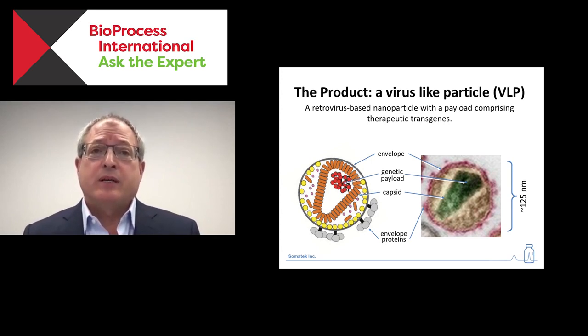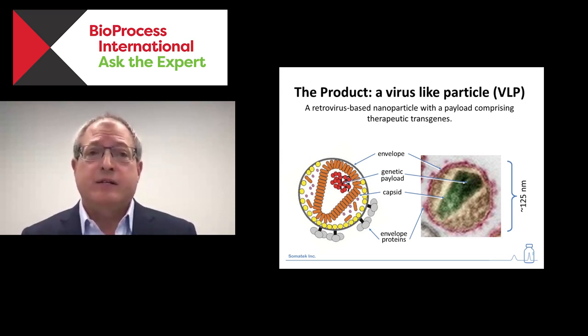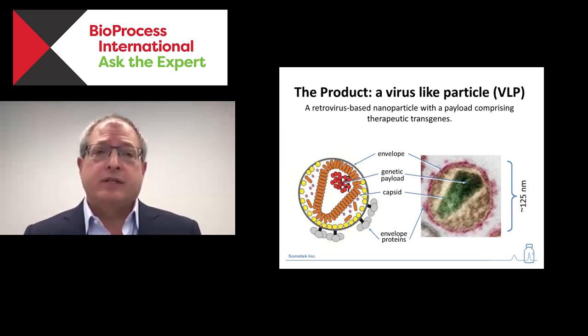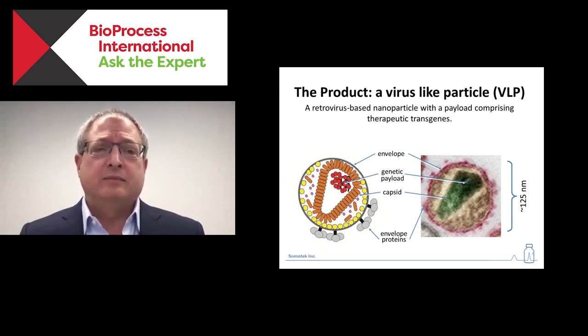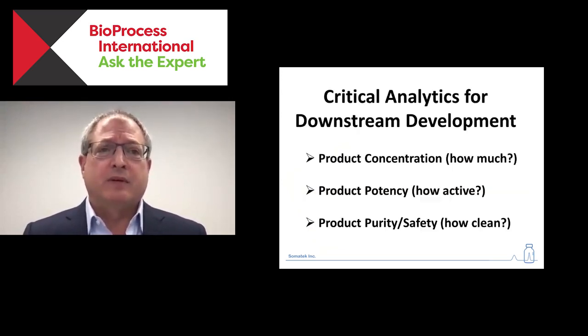The number of proteins, the exact charge of each protein is variable. And so this is a common challenge for people doing downstream process development for viruses: they tend to be heterogeneous with respect to charge and other characteristics. Perhaps AAV is an exception, but like I said, this is a common challenge.